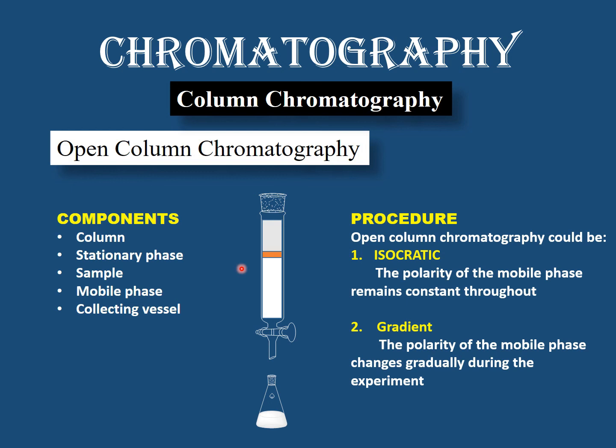So this is all about open column chromatography. We will talk about some other techniques which also come under the same heading of column chromatography in the upcoming lectures, that include the most sophisticated techniques such as HPLC and gas chromatography.